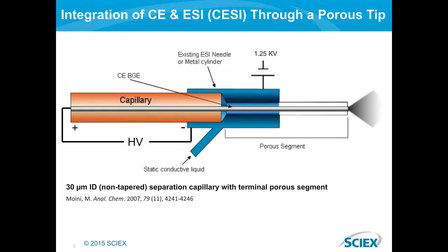This happens in the OptiMS capillary, the connection to the mass spec from the CE instrument, and this is where the science behind the connection really happens. In this connection, we have the capillary running from the CE, the same capillary you load your sample into and apply the separation voltage to. It runs through this OptiMS cartridge, and then through an area which contains conductive liquid.